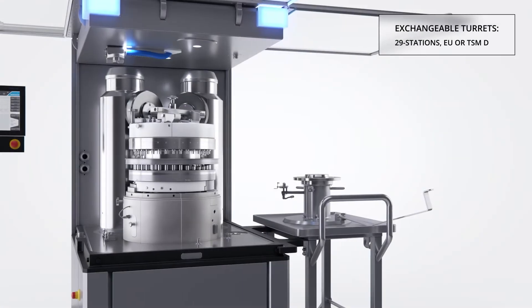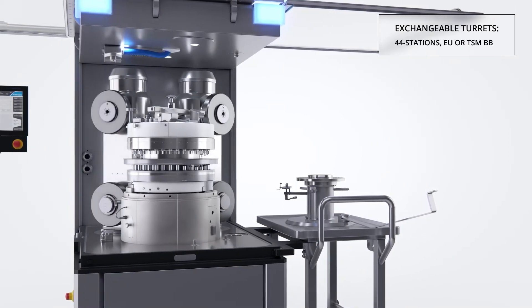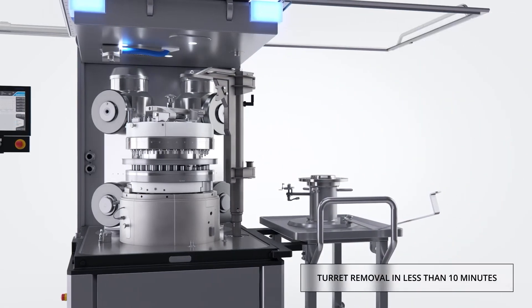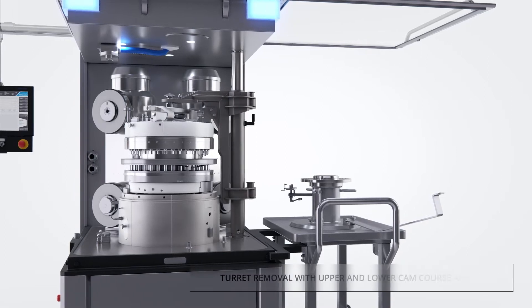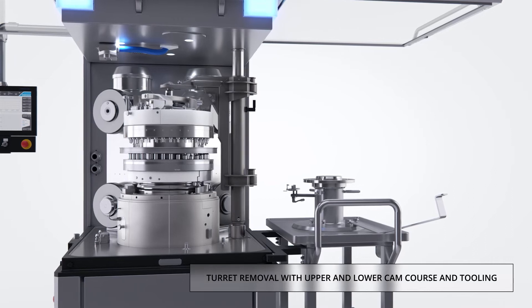The Korsh XL-404 offers an exchangeable turret capability, which provides the opportunity to run any tablet size on a single press and permits an extremely fast changeover from one product to the next. The XL-404 turret may be exchanged including the cams and press tools.